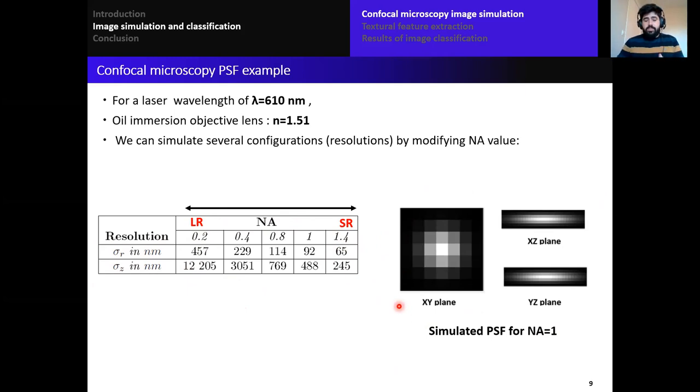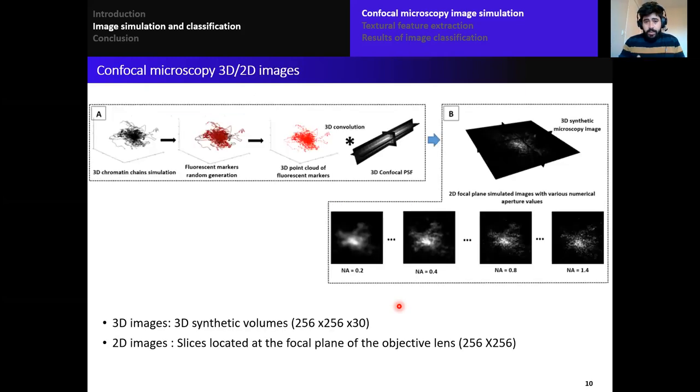This means that we have lower values of sigma r and sigma z. Here I show the three orthogonal planes of a simulated PSF for numerical aperture equal to 1. With this methodology of modeling, we can simulate several PSFs for each NA value and we can have different resolutions. Like that, the output images will have different resolutions also.